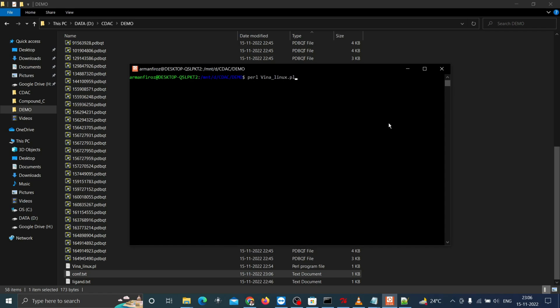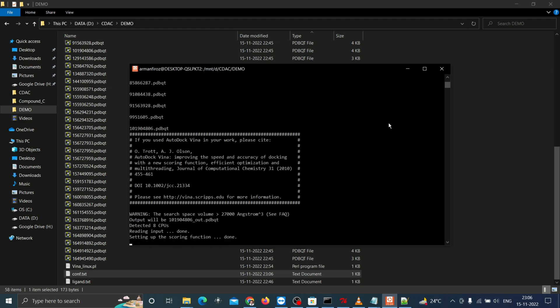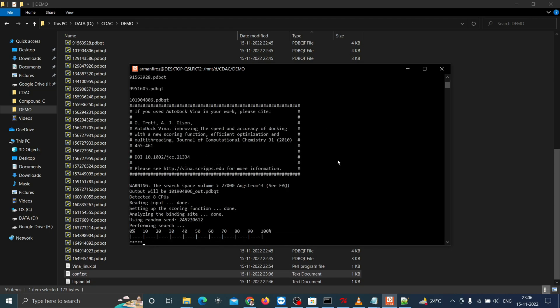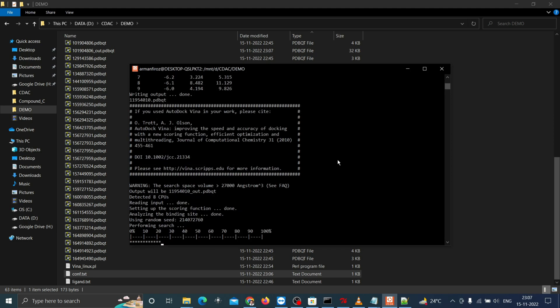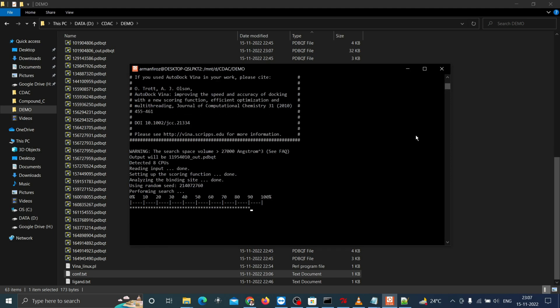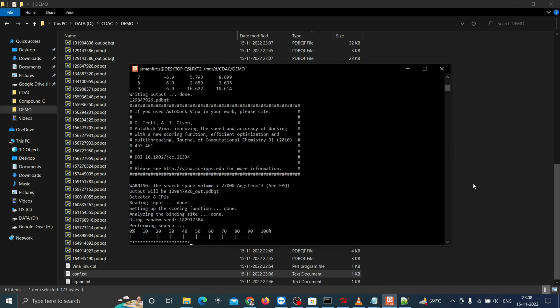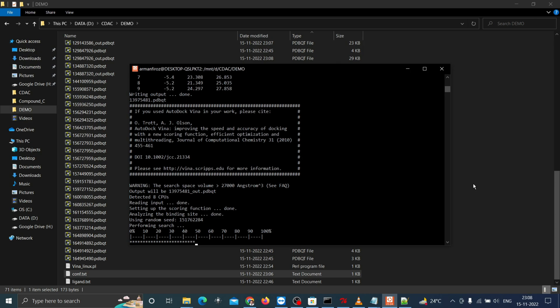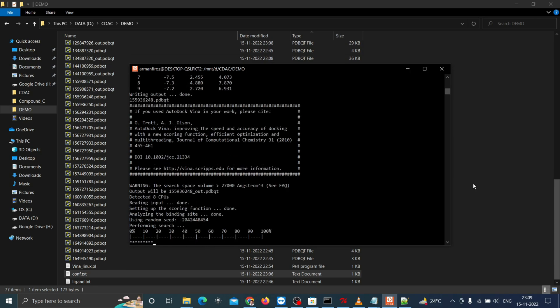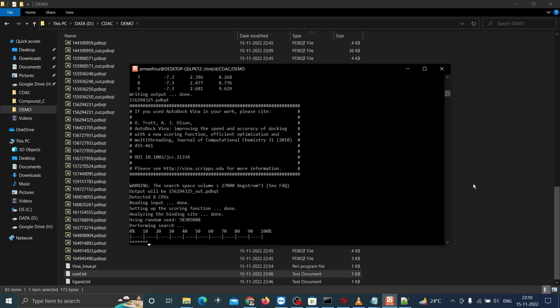Once you click enter, it will ask for the ligand file name. Type ligand.txt and enter. Now the protein ligand docking starts. You can see the live status of docking as the percentage and it will generate the affinity scores in both terminal as well as the individual files in the directory along with the output file with ligand coordinates after docking.